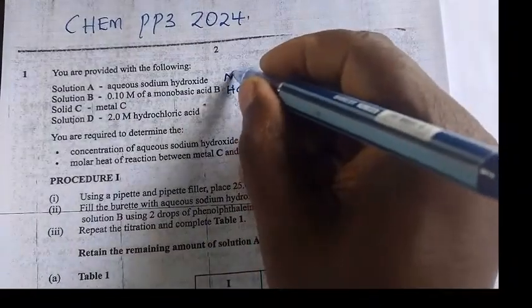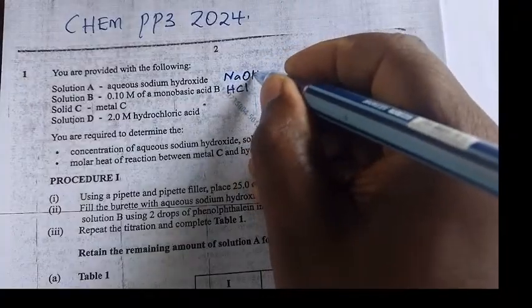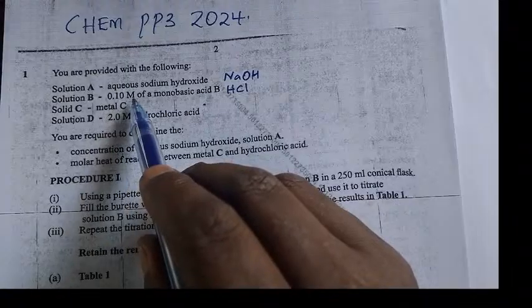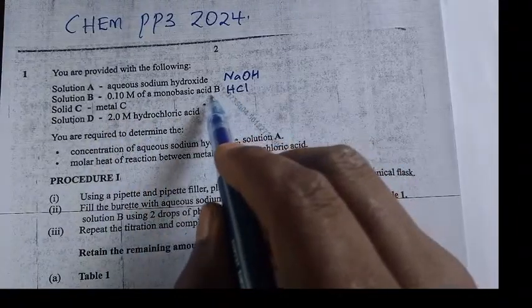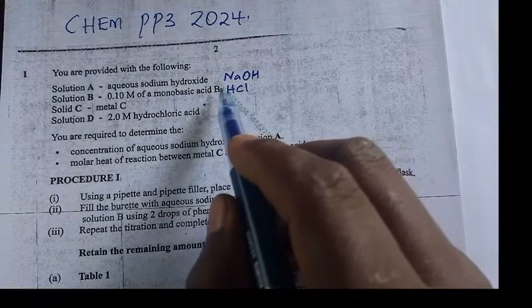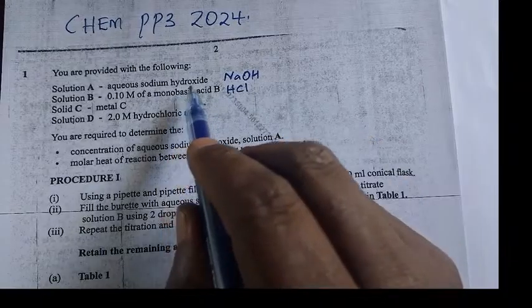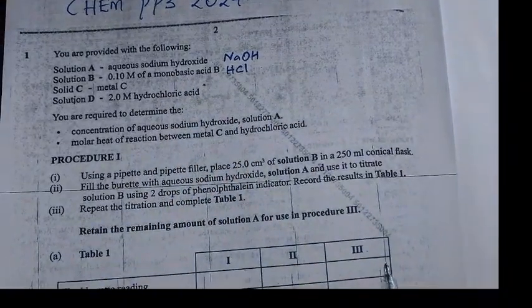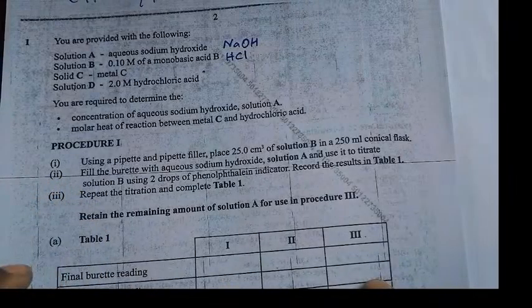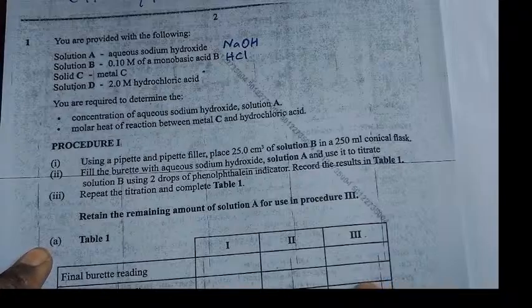So this is sodium hydroxide. Solution B is 0.10 molar, and an example is HCl. I'm not saying that solution B is HCl, but HCl, hydrochloric acid, is an example of a monobasic acid. The procedure is going to be: which solution is reacting, what is the volume of the first reactant, and what is the volume of the second. So those are the things.